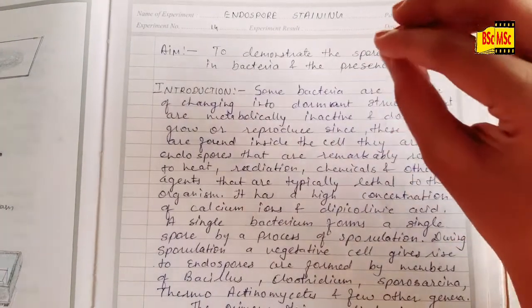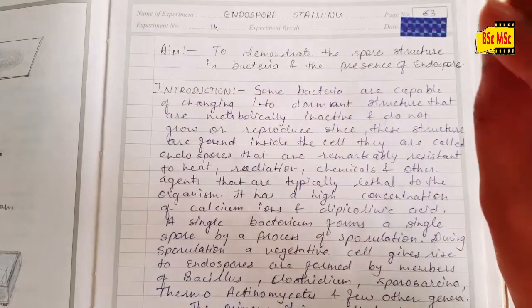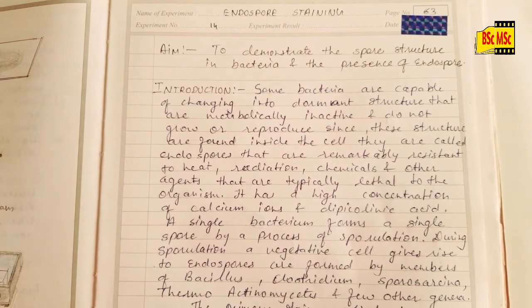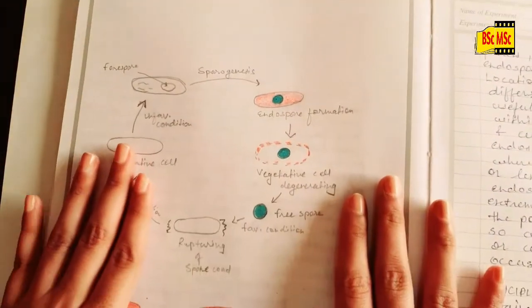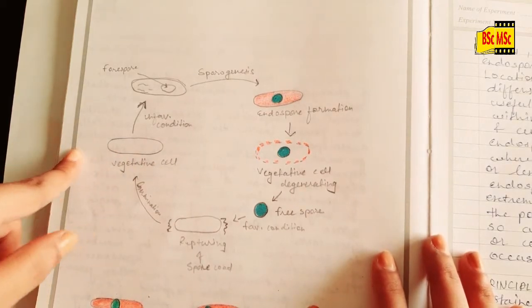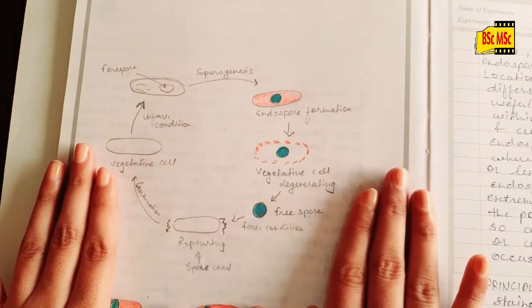Why is it highly resistant to heat? Because of the high concentration of calcium ions and dipicolinic acid. So what happens? These vegetative cells form and produce the endospore during sporulation. Let's see. This is the vegetative cell, and it reproduces by binary fission. But here we'll be seeing the sporulation procedure.